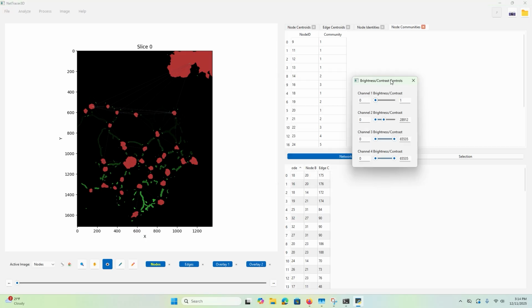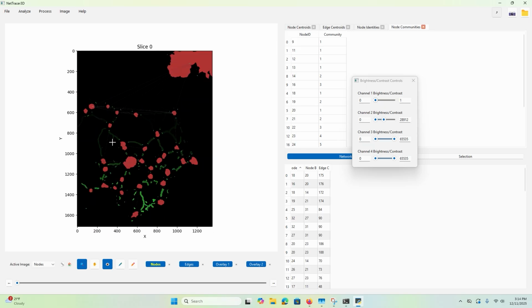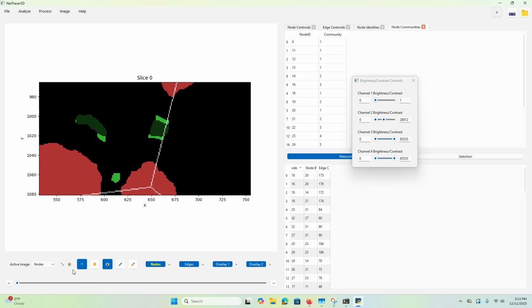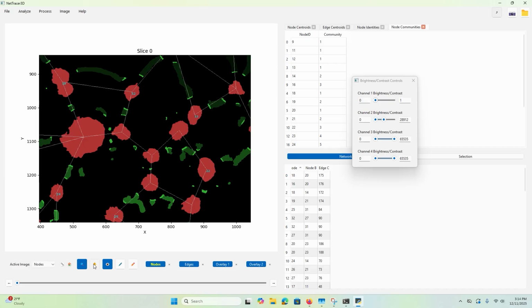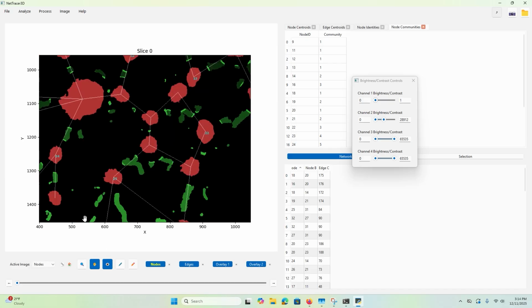And then interacting with the window, some of the options you have here, this is the zoom. So click to zoom in, right click to zoom back out. You can click and drag to zoom into a specific target, or you can press this home button and this will always bring you to the max zoom out again, which can be useful if you kind of get lost in your image somewhere. We have this pan option. So, you click on the hand, you get to pan around.